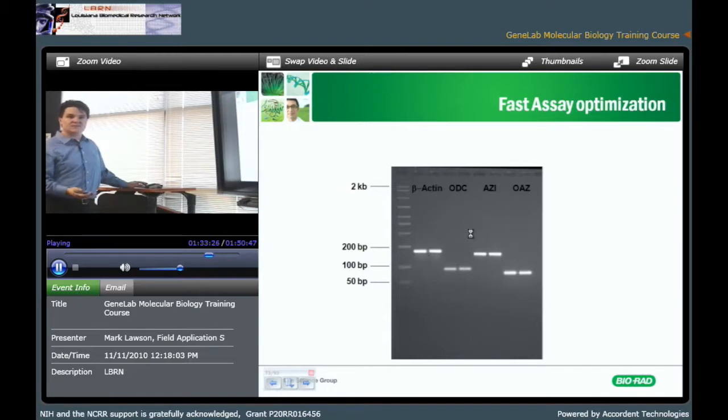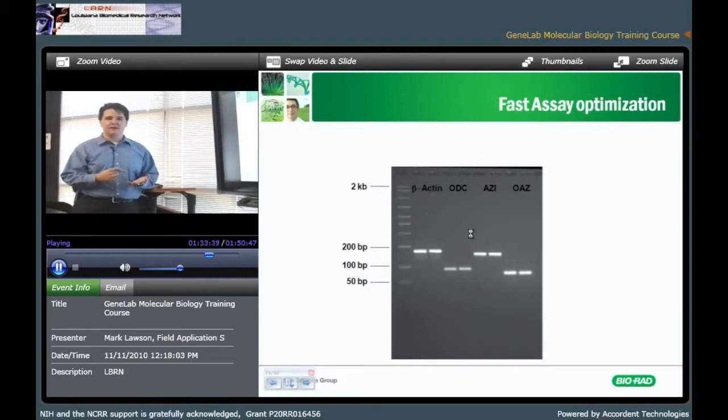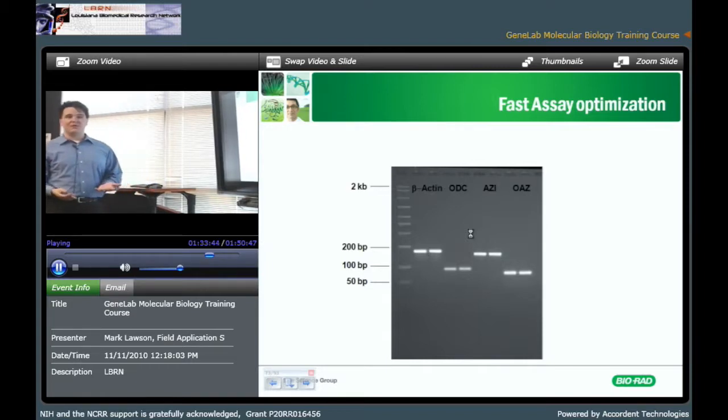You just basically need 1 sample and you need a lot of it. A lot of people have started creating pooled samples. So they harvest a couple of cell lines, pool all the RNA together, and make one giant cDNA. And they use that for positive controls, optimization, validation, and anytime they want to do troubleshooting, because they know that it's of good quality and there's more than enough of it to throw away.